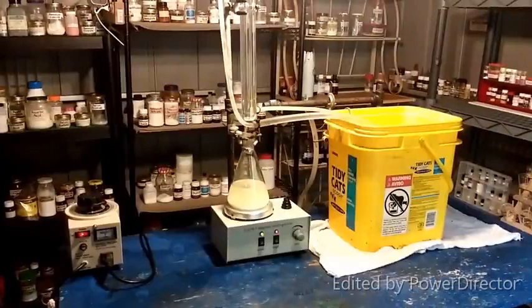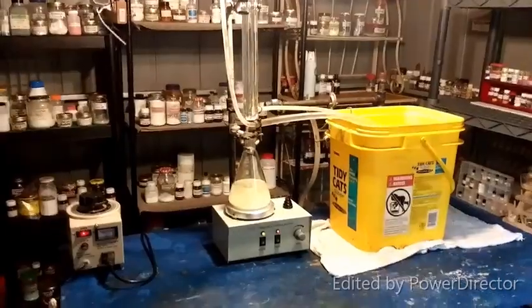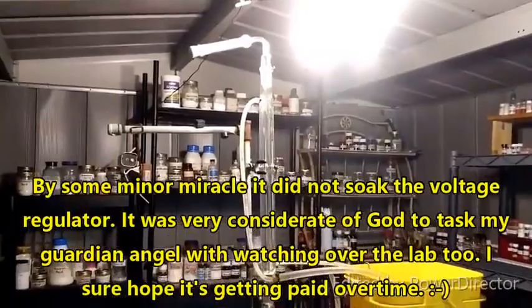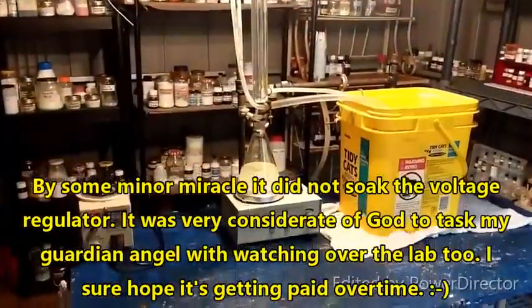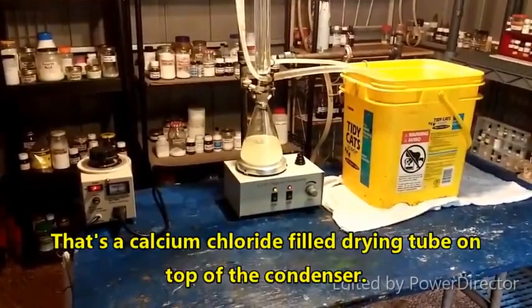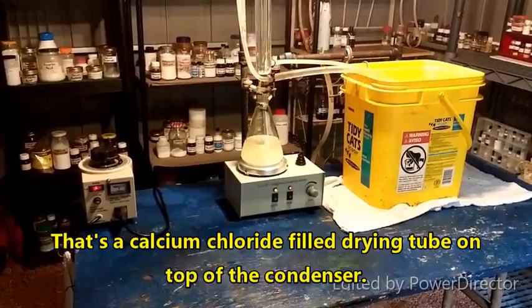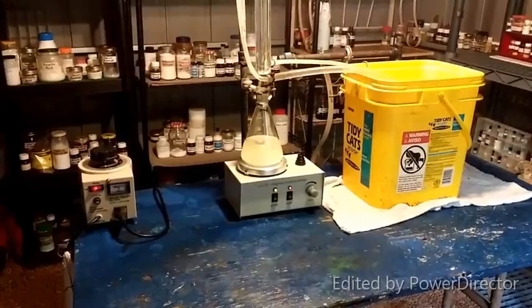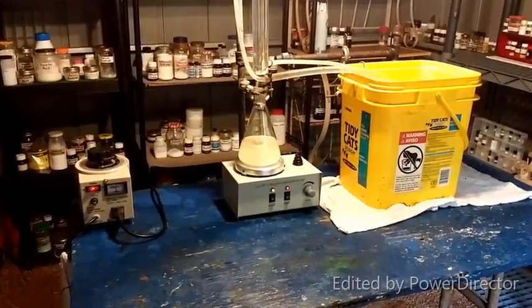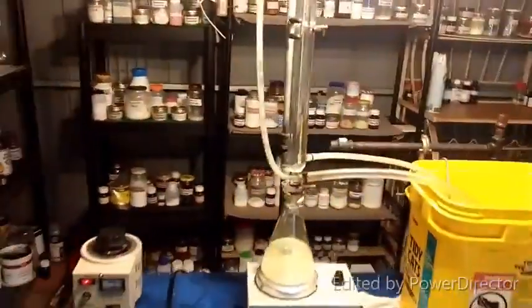Alright, everyone, we are rocking. Had a minor accident where the hose pulled out of the top of the condenser. It slipped off, but it is zip tied on there now, so hopefully we won't have any further issues because I really don't need this getting soaking wet. It would be really expensive to replace that voltage regulator. Anyway, so the reaction is going now.